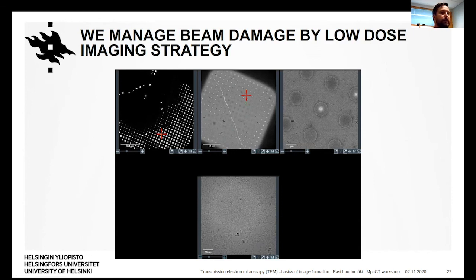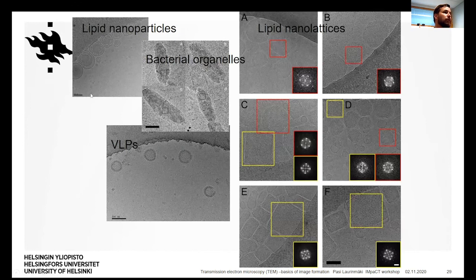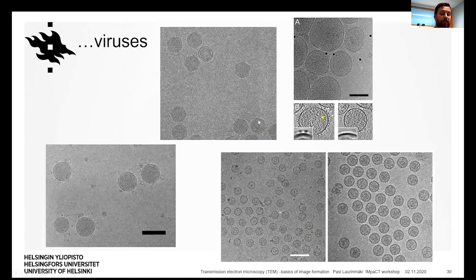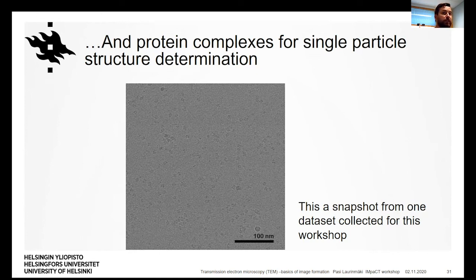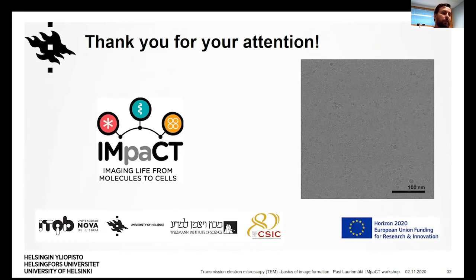This talk is now coming to an end, and I would like to conclude by showing you a variety of biological samples — just examples of what we have imaged over the years, starting from bigger things and moving towards smaller things. We've been looking at lipid nanoparticles, purified bacterial organelles, lipid nanolattices, virus-like particles, and many different viruses. But these days most of our work is focused on purified protein complexes that are picked out from the raw data and used for single particle structure determination. This image can be considered an appetizer or taster for this workshop — it's actually a snapshot from one of the datasets collected for this workshop, and one of the groups will be processing this data. With this, I'd like to conclude and thank you for your attention.